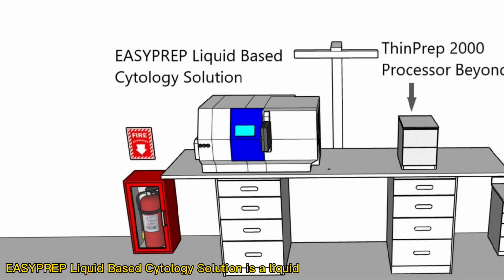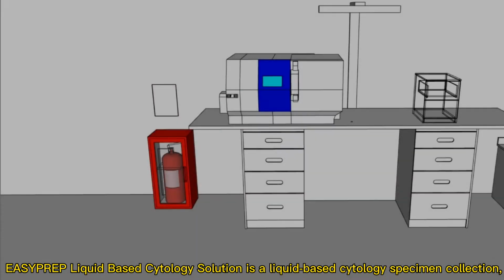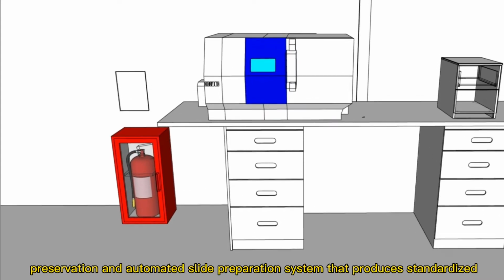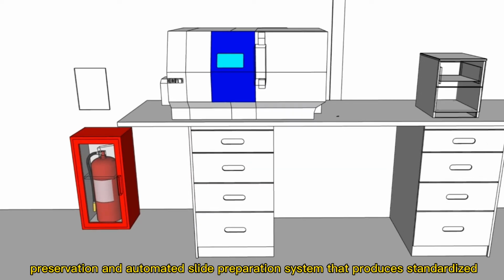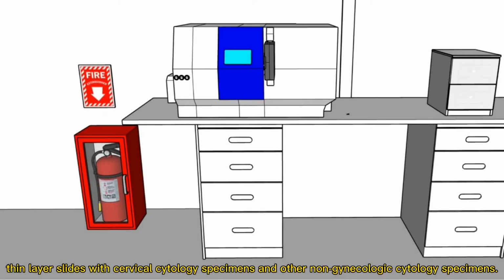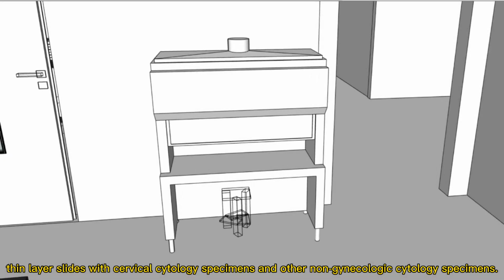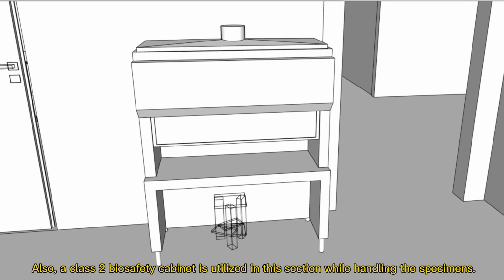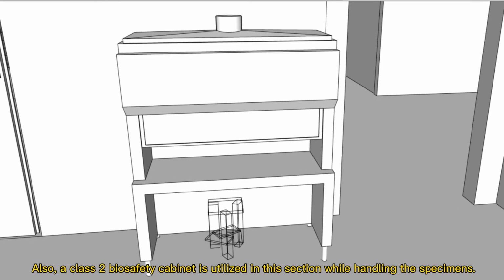EasyPrep liquid-based cytology solution is a liquid-based cytology specimen collection, preservation, and automated slide preparation system that produces standardized thin-layer slides with cervical cytology specimens and other non-gynecologic cytology specimens. Also, a Class 2 biosafety cabinet is utilized in this section while handling the specimens.